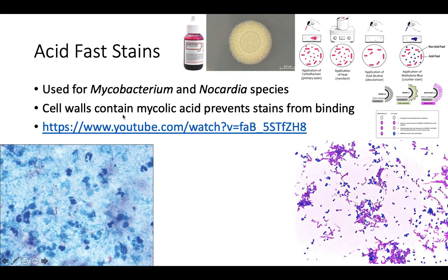But anyway, they have a gram-positive type cell wall setup with their big, thick peptidoglycan layer, their one membrane, so they essentially are a gram-positive cell. But they do have an extra little thing added inside of their cell walls called mycolic acid. And you can see that over here, our gram-positive traditional cell, our gram-negative cell, and our gram-positive acid-fast has mycolic acid embedded inside of its cell wall, its peptidoglycan layer.